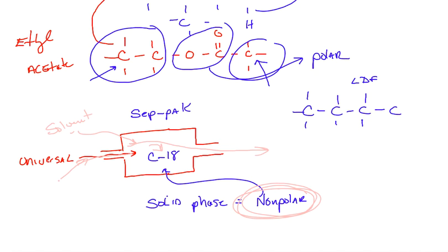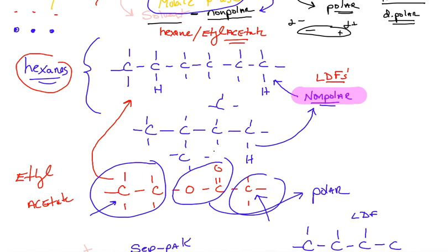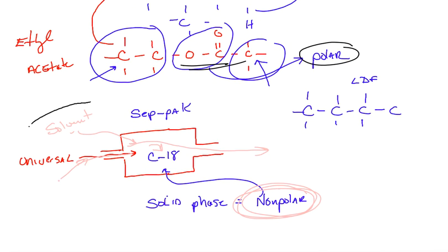You may say, Mr. Grodsky, isn't the solvent pretty much nonpolar? Yes, but if you remember, there's an ethyl acetate, a polar characteristic in here. All right, so in any case, our solvent's mostly nonpolar, but it does have some polar characteristics. So what comes out first? Well, the ones that like the nonpolar C18 would probably stay last, and the ones that come out first probably like the polar characteristic, even though it's a little bit. Remember, we're giving the chemicals a choice.